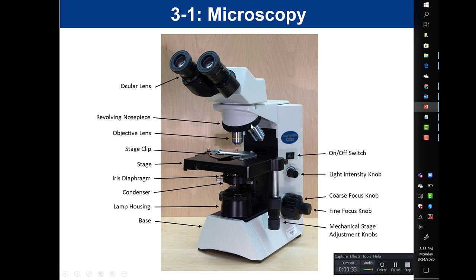Down here is the revolving nosepiece, which can rotate and switch the objective lens. These lenses down here are our objective lenses. On our microscopes we have a 4x with a red ring, a 10x with yellow, the 40x is blue, and the white 100x lens is behind. Those are the objective lenses, and they move on the revolving nosepiece.